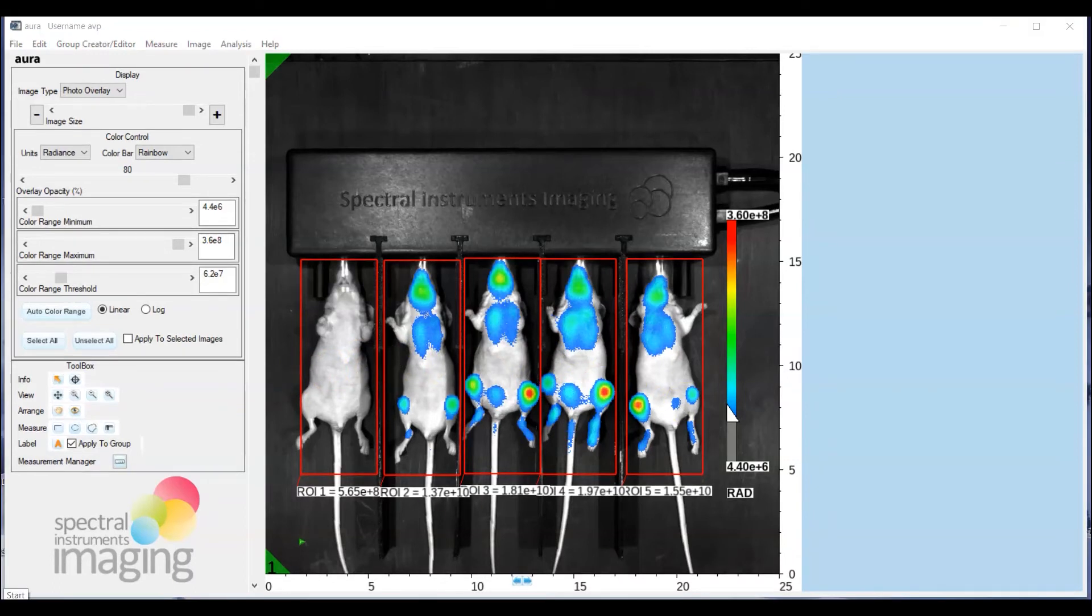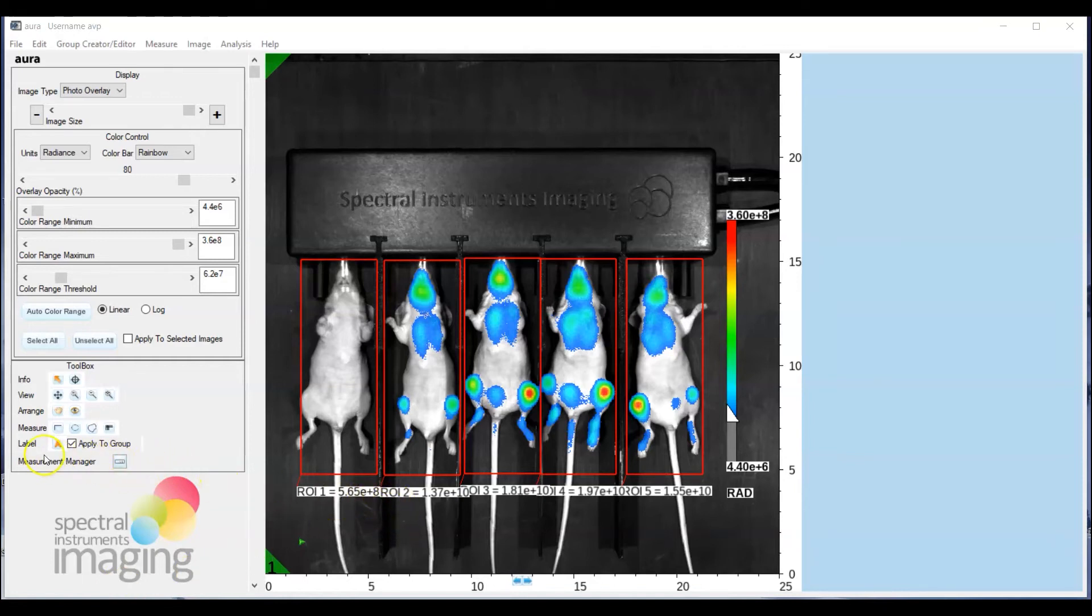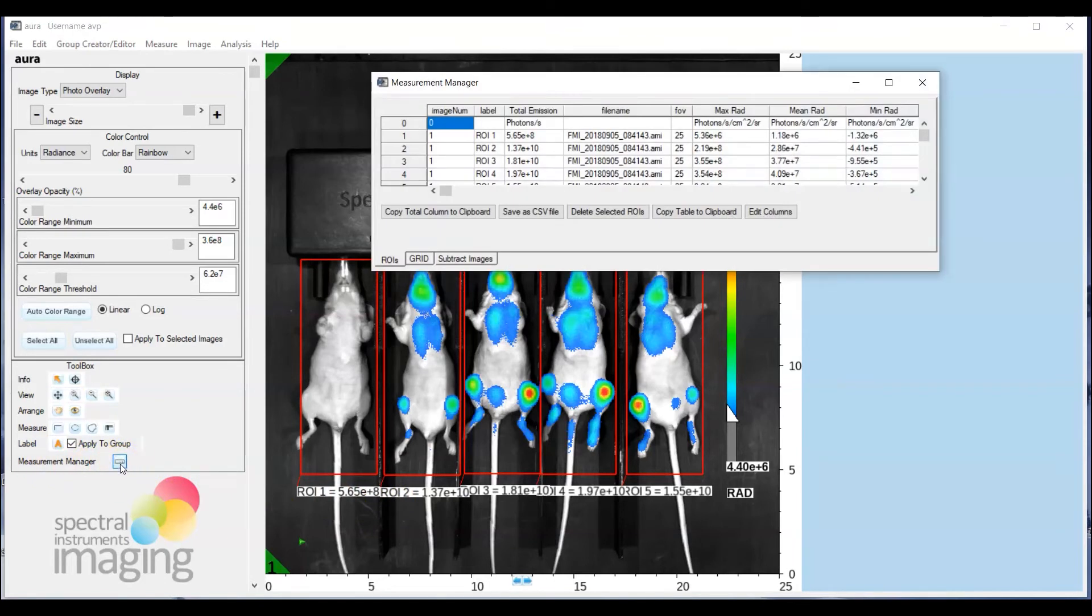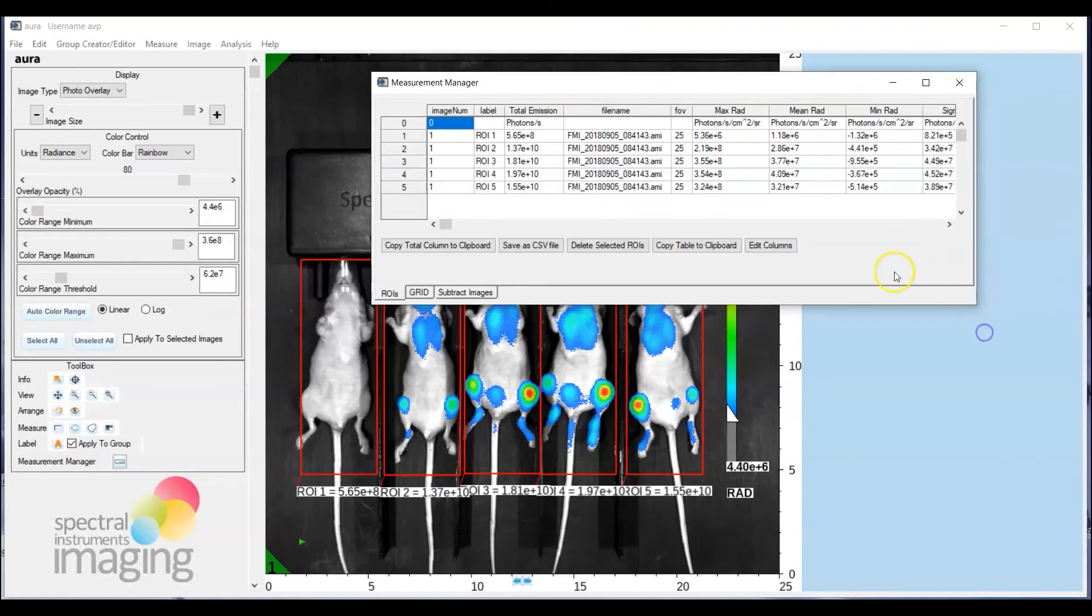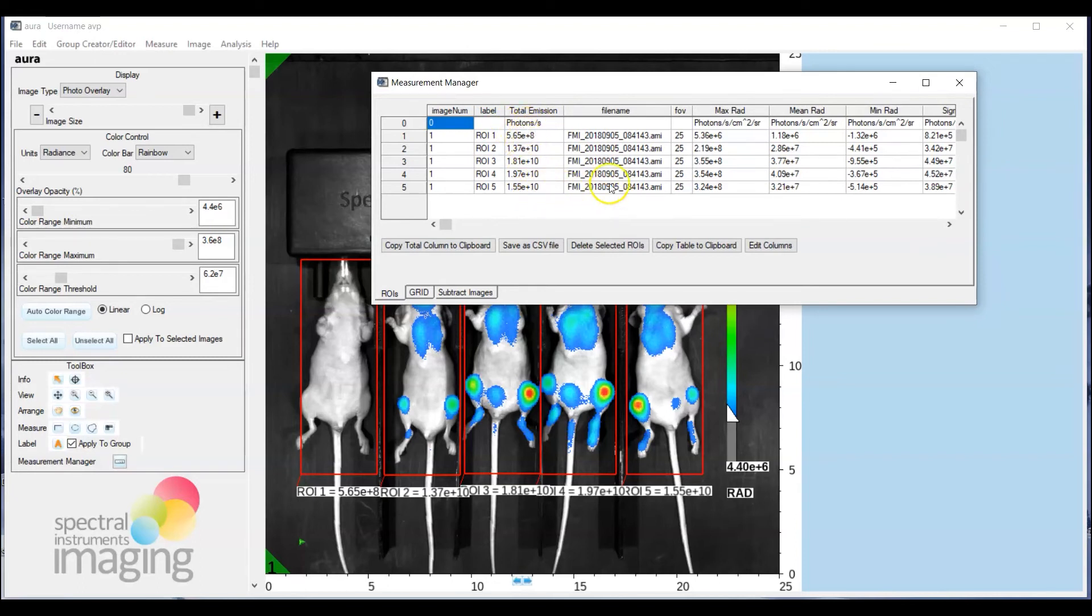All right so now to get a visual summary of the ROI data that we just generated here you can go to tool box and then to measurement manager and select this icon that looks like a ruler and what you'll see is the measurement manager window will open up and you get a summary of the individual ROIs and their total emissions in terms of total photons per second.